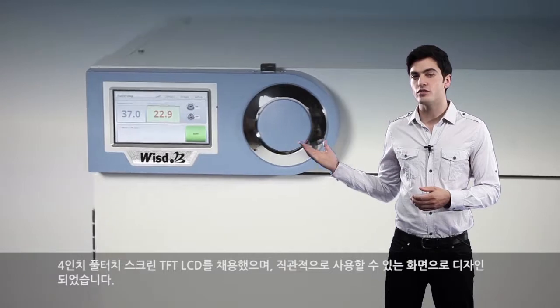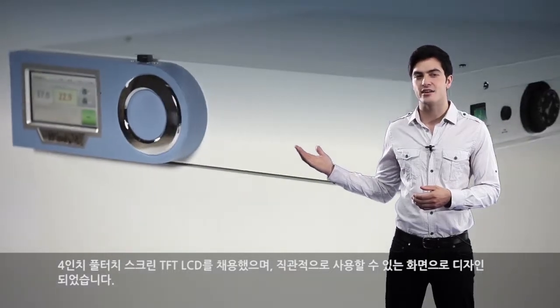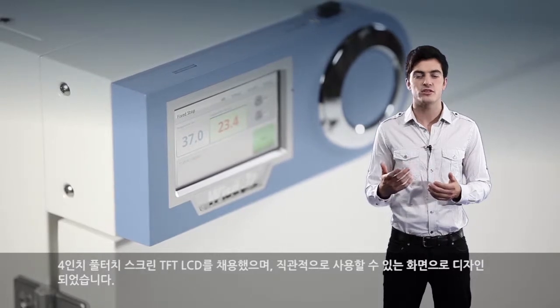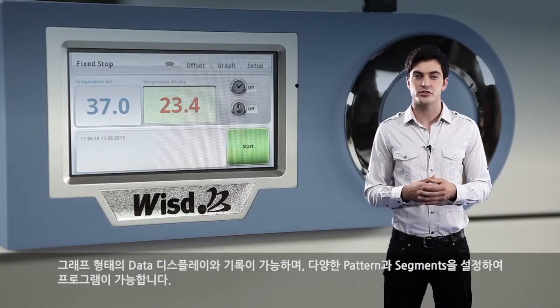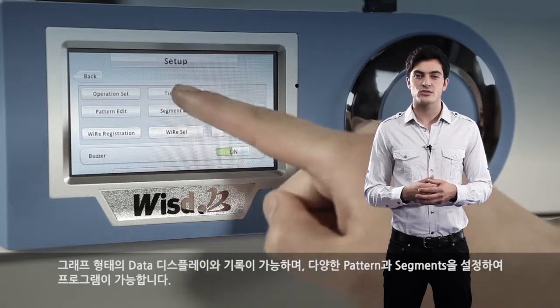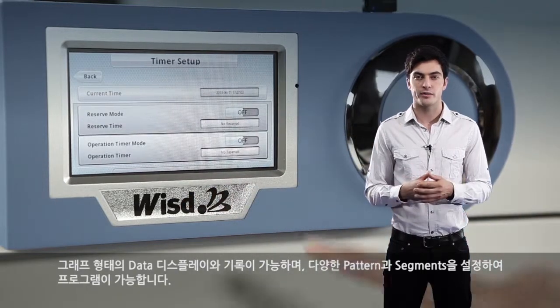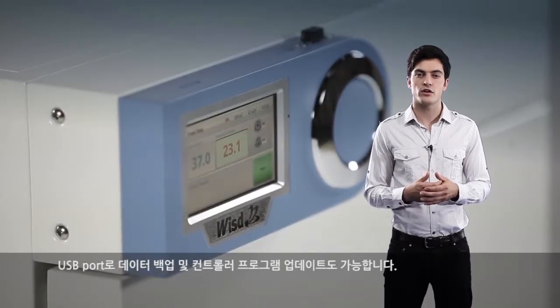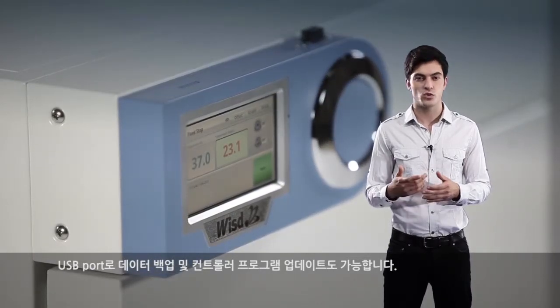A four-inch full-touch screen TFT LCD is incorporated into the controller that enables intuitive usage. On-screen temperature chart and log, as well as diverse preset programming, is feasible. Data backup and controller software update are enabled using the USB port.